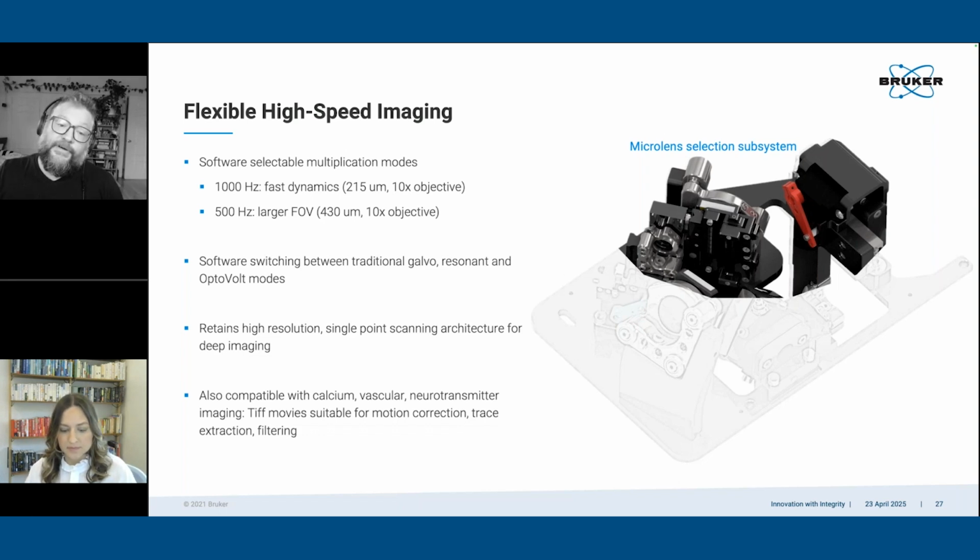If you are working in a situation where you have like a 3 millimeter working distance objective and you need another millimeter, it's probably not going to be enough. But it does actually extend your working distance, because it's essentially changing the collimation of the light going into the objective. So basically, either converging it or diverging it to adjust the focal point.